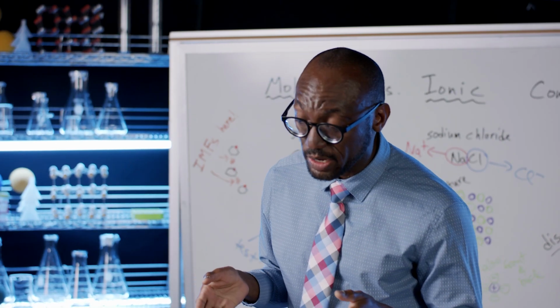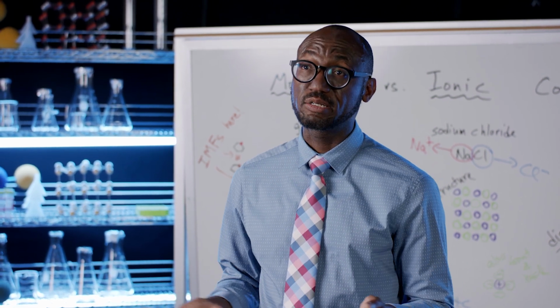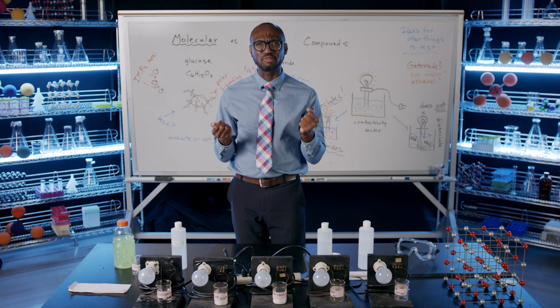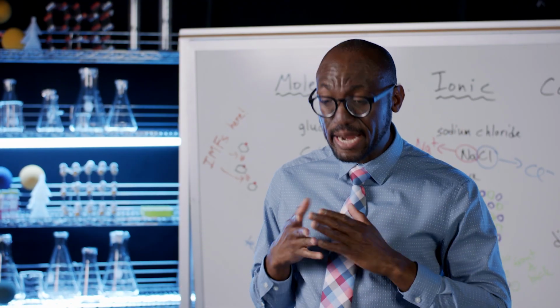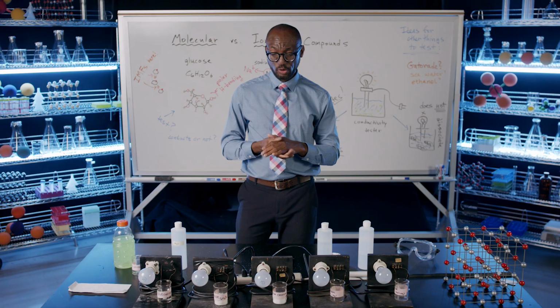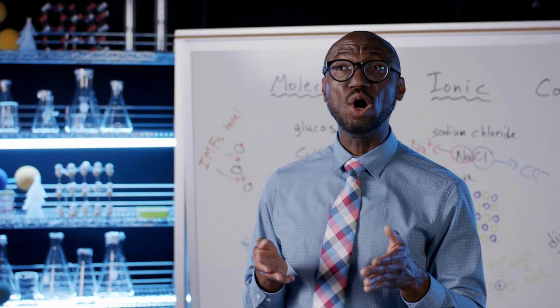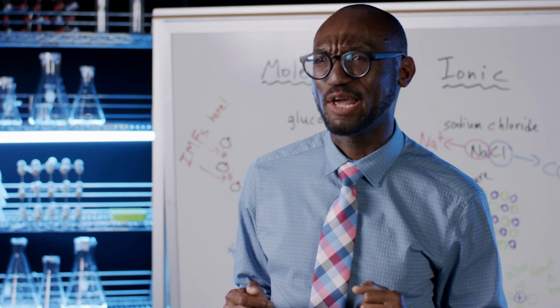I think I'm seeing a trend here: glucose or salt, neither of them conduct electricity. But this doesn't make sense. Sodium chloride consists of charged particles, not neutral molecules like glucose. So what's happening? Why doesn't this conduct? Of course, the ions and molecules are relatively static in the solid. So dissolving the solids in water allows the particles to move around. Maybe just maybe this will help.